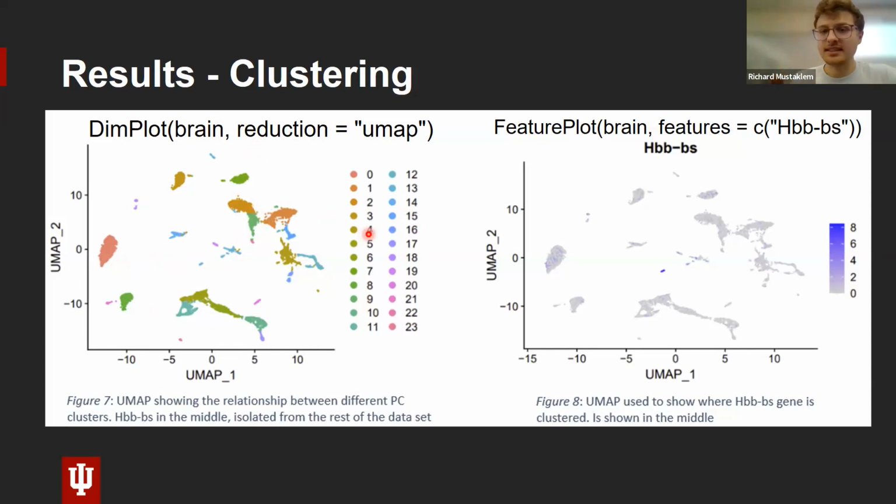But first, before we get into cell types, let's say you were interested in just genes. Let's say you wanted to look up microglia markers. Okay, this isn't a microglia marker, but let's say you want to. Instead of this line here, you can type in just genes and it can search for just genes and where they're located and how they're related to one another. And this is very powerful too. Let's say you're doing a study on a certain type of gene within your tissue. You can just track that gene and say, wow, look at how it's related, or it's not related at all, to other cell types. There's a lot of power within this graph.